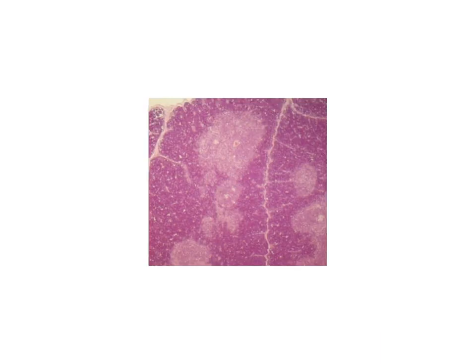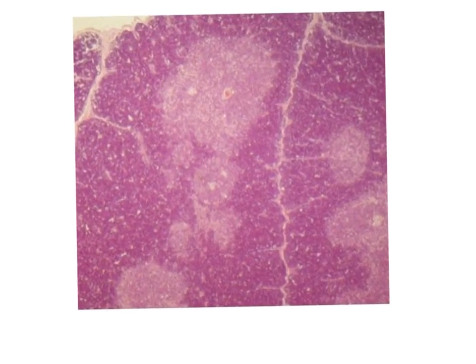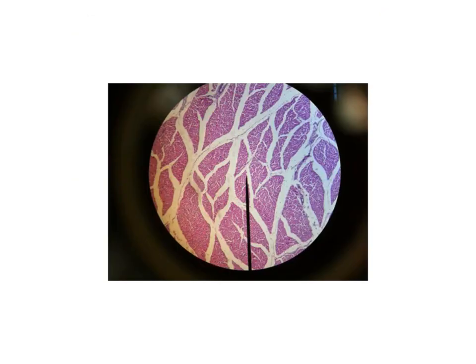Also, this slide has the same information, but it is concentrating on a few lobules only. We have this lobule in which we have a dark cortex here, and this is the medulla, and as you see, the medulla is sometimes communicating between different lobules. So lobules with a dark blue cortex and red center are for the slide of the thymus.